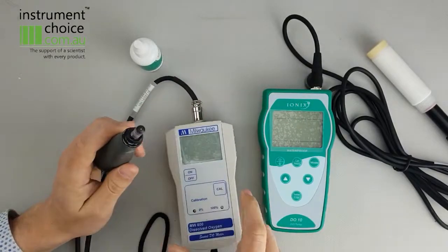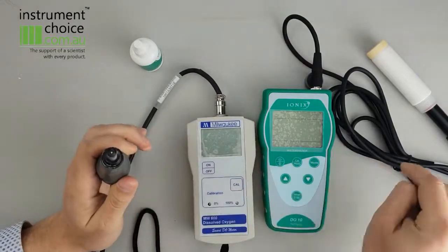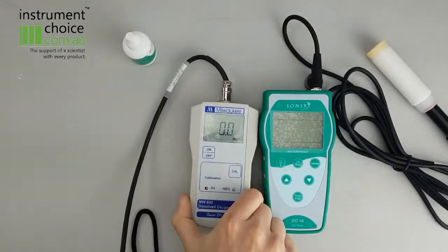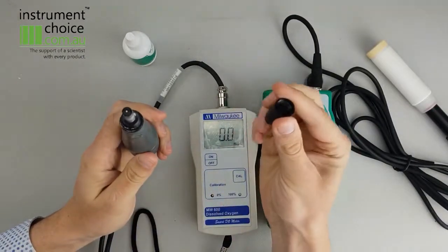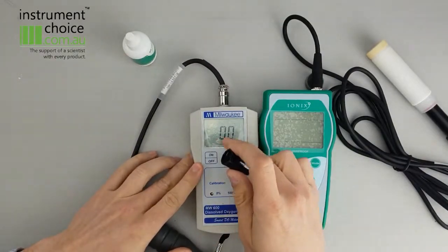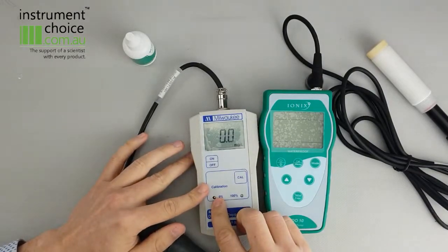So we'll just run through the calibration procedure on the Milwaukee and then I'll show you the one on the Ionix, just to show you the difference in terms of time frame. So to do the Milwaukee one, the best procedure is to do an open air calibration. To do that, you take off your electrolyte field cap and expose the cathode. Basically, when that's removed, it should be showing 0.0. If it's not, you adjust it using the screw down the base.